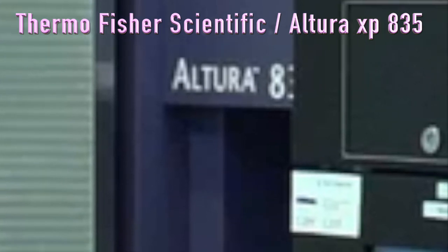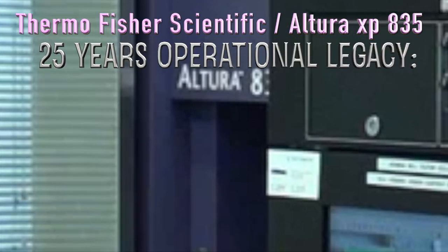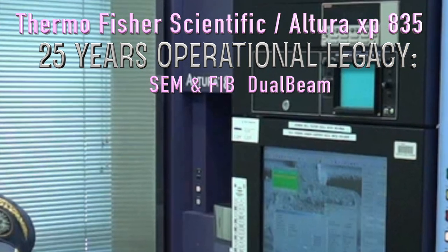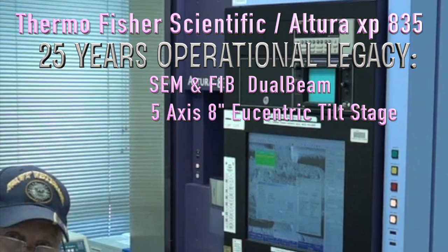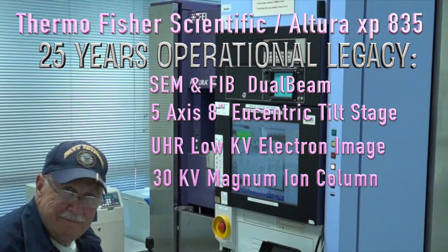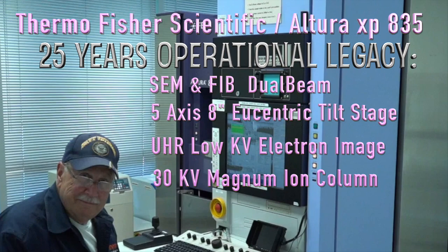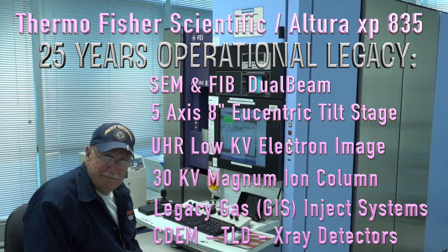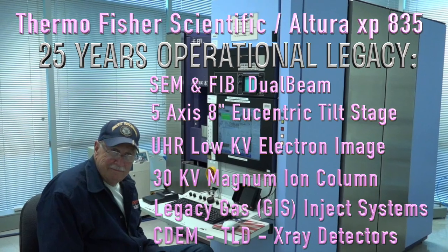Doug Harper. I've been with the FEI company and Thermo Fisher for 23 years now, and I'm happy to show you around the 835 today. This dual beam is a genetic heart and soul of our tool sets that continues to develop as I speak. They're getting better and better to both use and to service. It's been a pleasure to work with these tools and all my colleagues around the world.